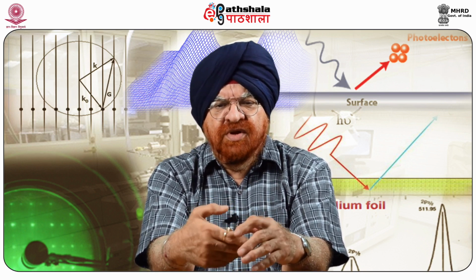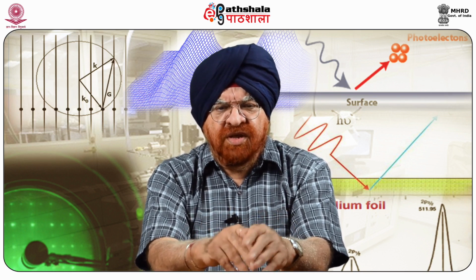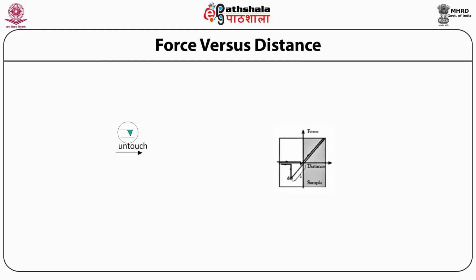The cantilever is in the repulsive contact region of the cycle, and the adhesion interactions between the tip and the surface are analyzed. The deflection of the cantilever will provide information on the mechanical properties of the material during the part of the approach and the retraction. Force versus distance.